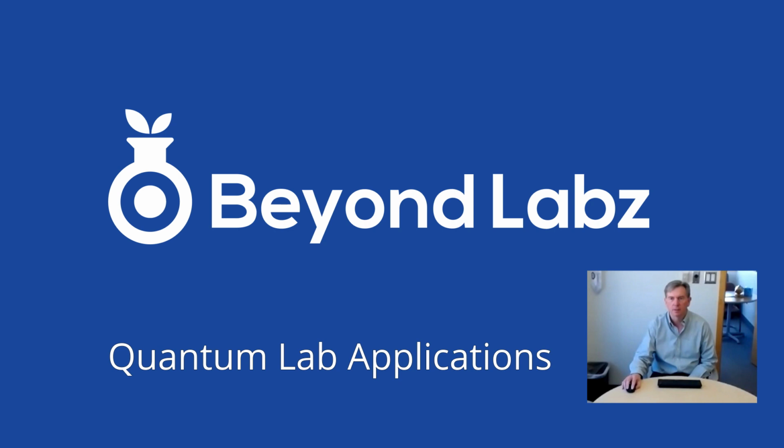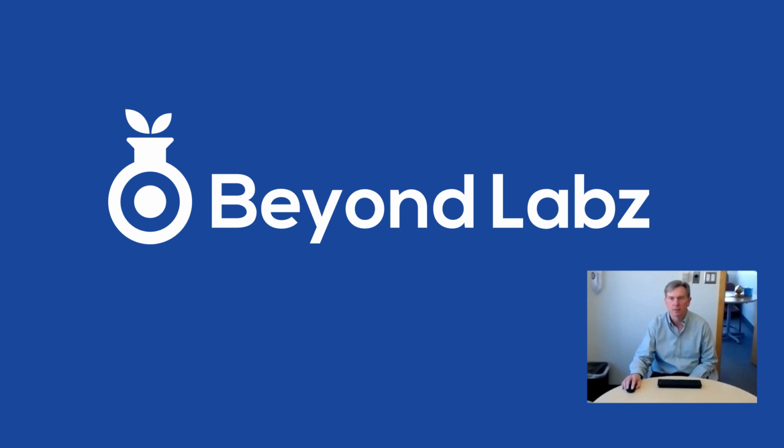Absolutely. Western Governors University, for example, uses our general chemistry calorimetry and quantum labs for those upper division PChem courses they're teaching online. Absolutely. And we do have physics, which isn't really relevant for chemistry, but we do have physics labs with some optics and circuits and mechanics in them as well. Okay, thank you.